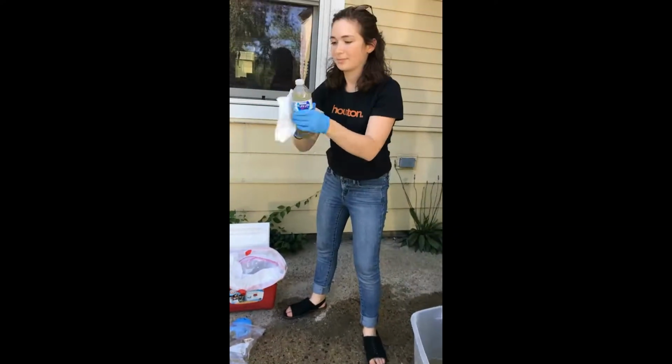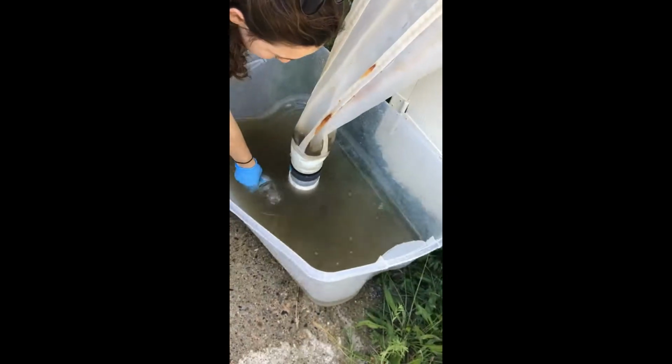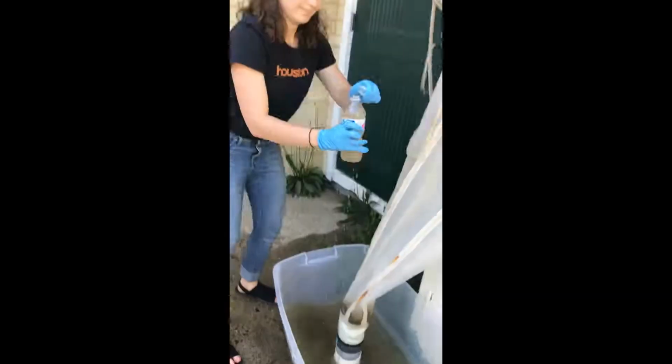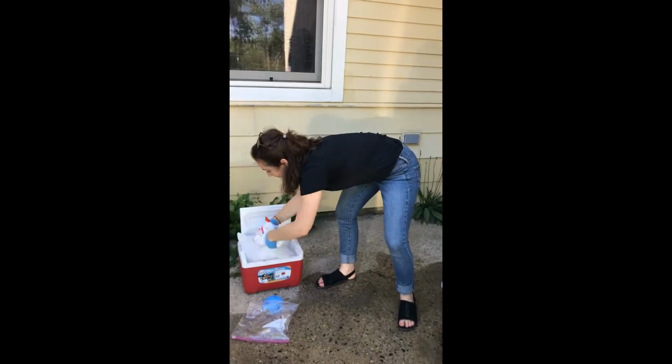Another thing that we can do is unscrew that cod end that's collected all of the biomass and pour it into a sterilized blender. We can blend that up until it's a homogeneous solution, take a subsample and sequence that in the lab as well.